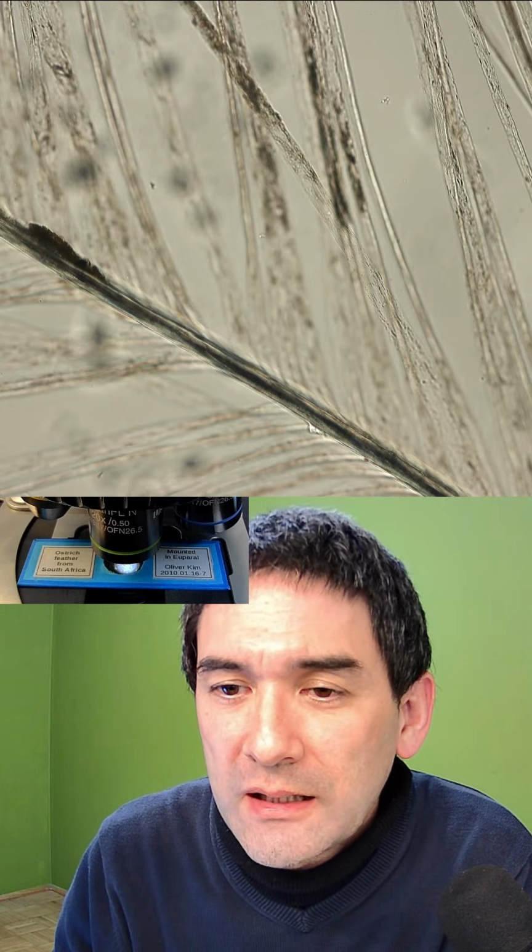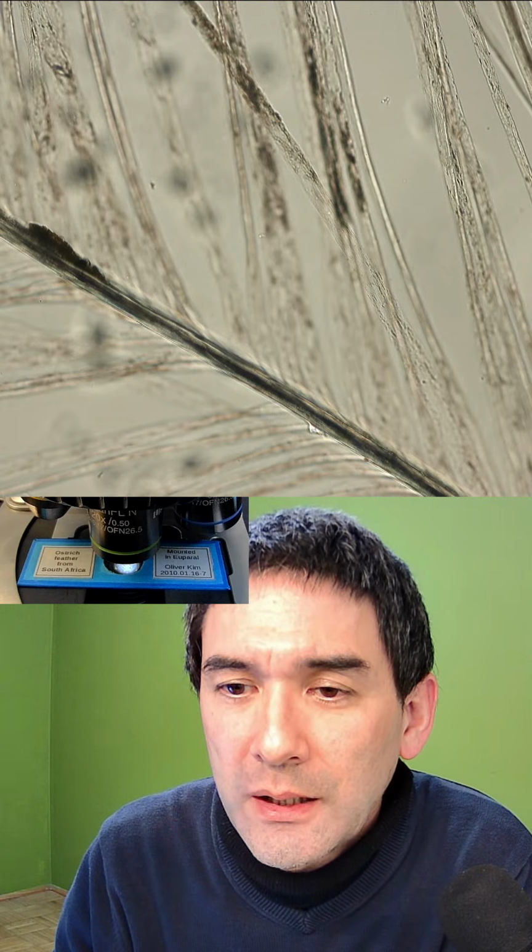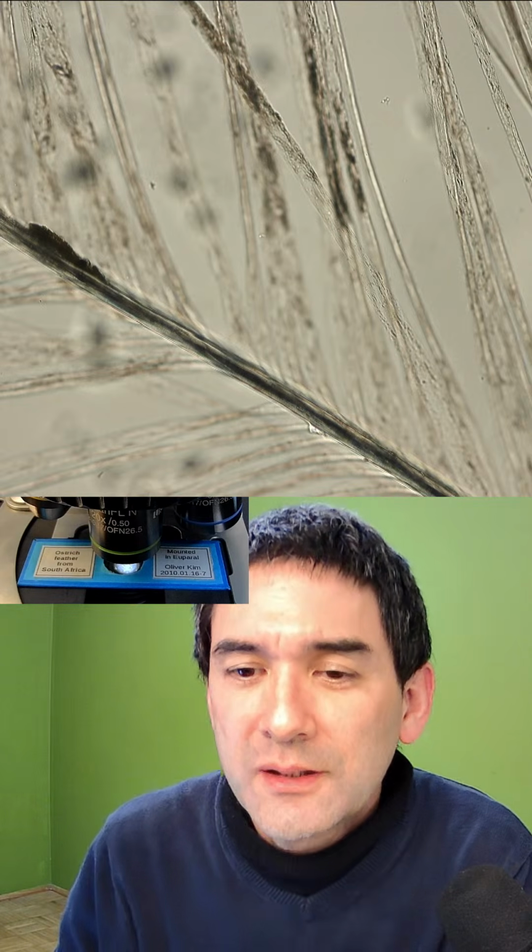Let me check again. Yep. Okay. So occasionally when I pause, I will have a look here.